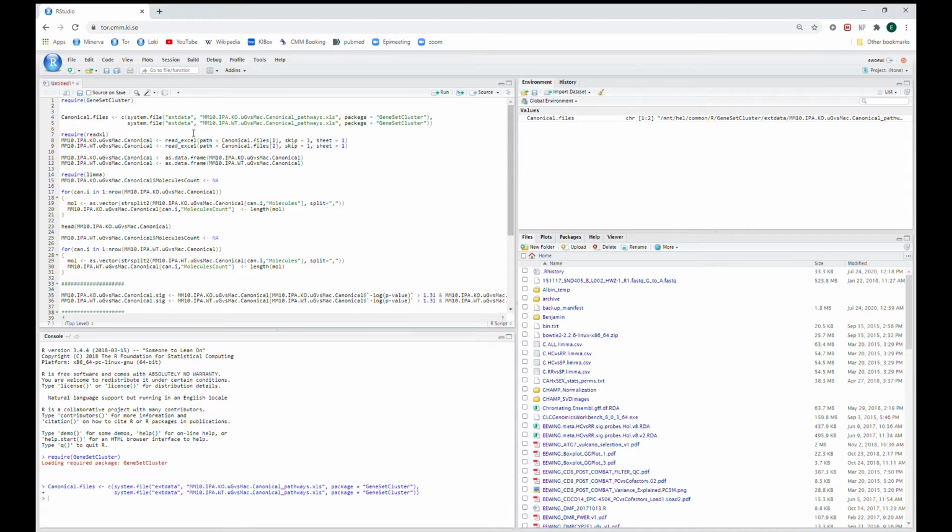In this case, we are running an example of mice which have either wild-type genetics or a knockout for the TGF-beta receptor. And then we isolated microglia and macrophages, which we sorted by FACS. And then we wanted to see, on a sequencing level, using the DESeq2 pipeline, what are the differences between the two different cell types? And so this is microglia versus macrophages, and how are they affected by this TGF-beta knockout?